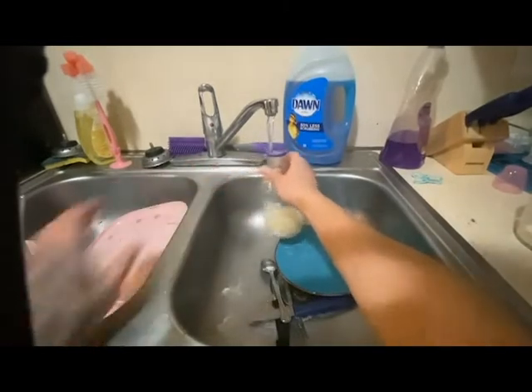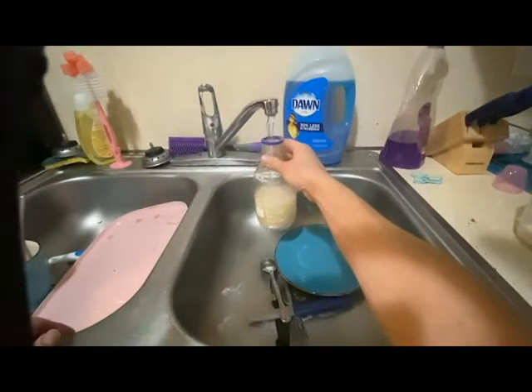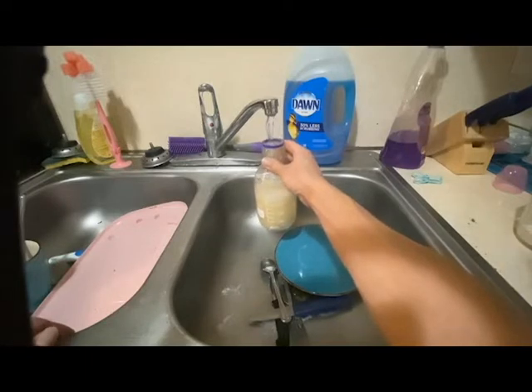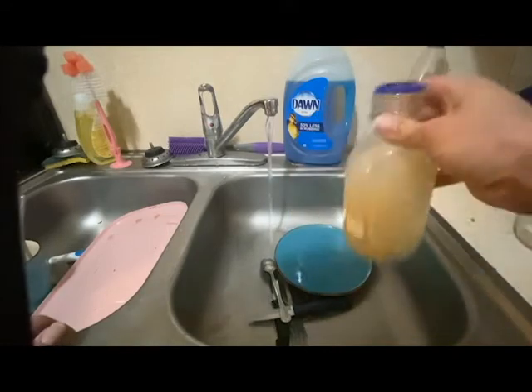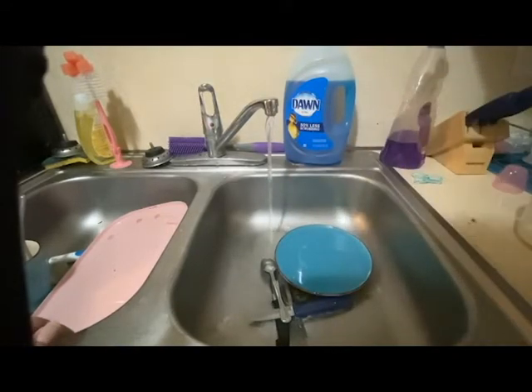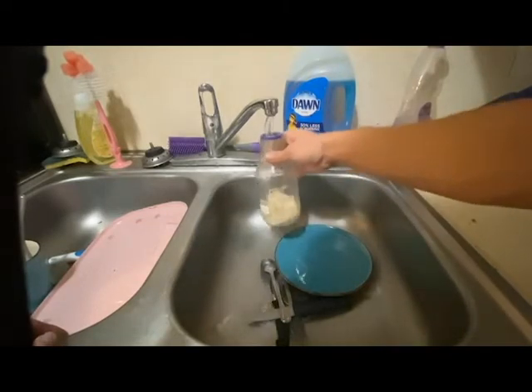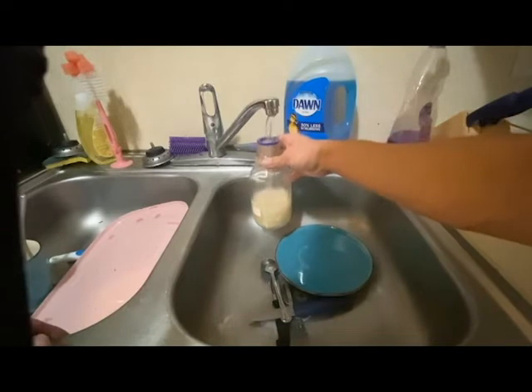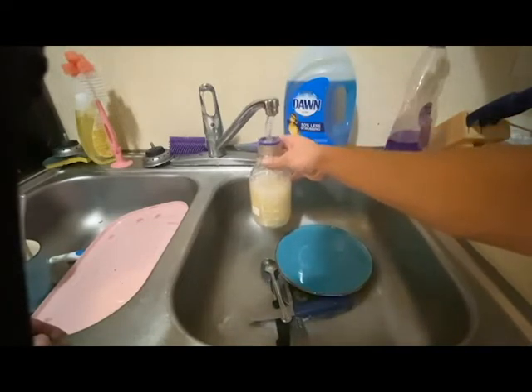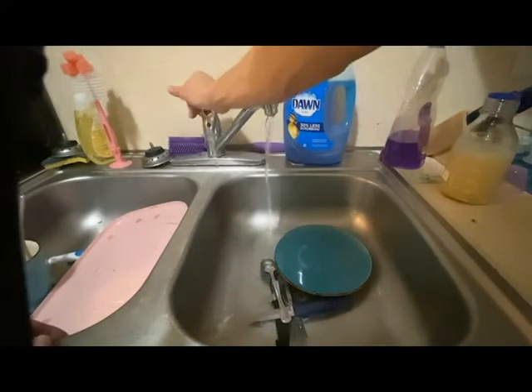Sometimes I use bottled water. Sometimes I use tap water. I don't think it really matters. It's all going into the pressure cooker. Our water is a little bit harder out here, so we do get calcium stains on the glass and stuff. But as far as how it reacts with the mycelium, it's not bad. I can't really tell the difference.